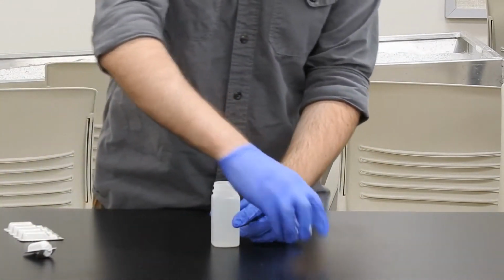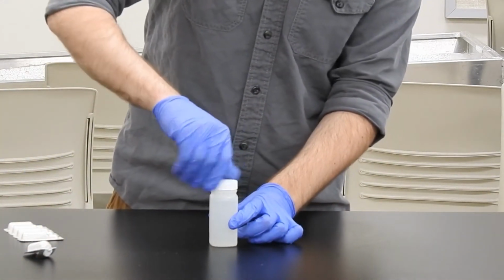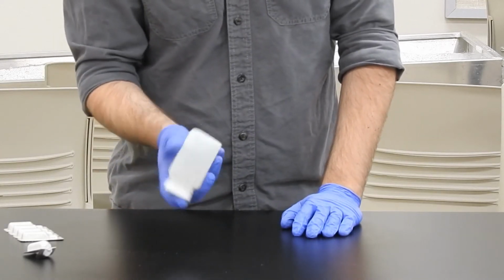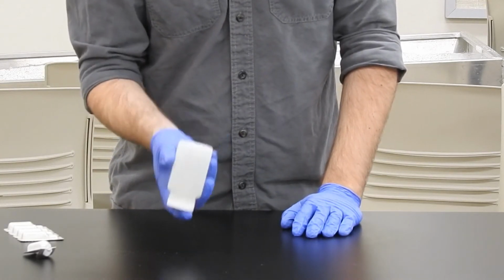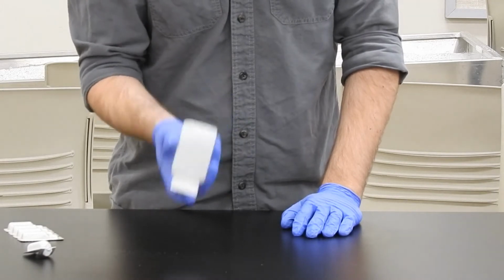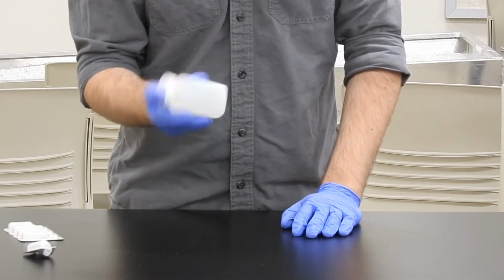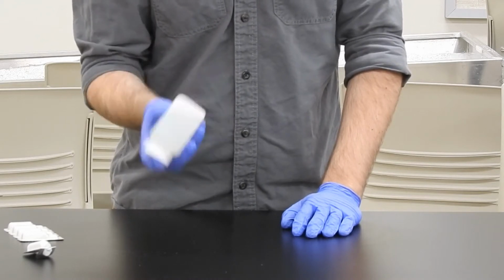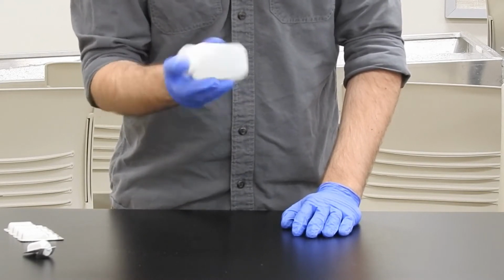After all of that has been added into the bottle, you can close it, and then the next step is to invert it 29 times. An inversion is to tip it over once and back, and you'll notice that that takes some time, so I've sped it up here to make the editing a little bit easier. So again, inverting it over and back until it's thoroughly mixed through.